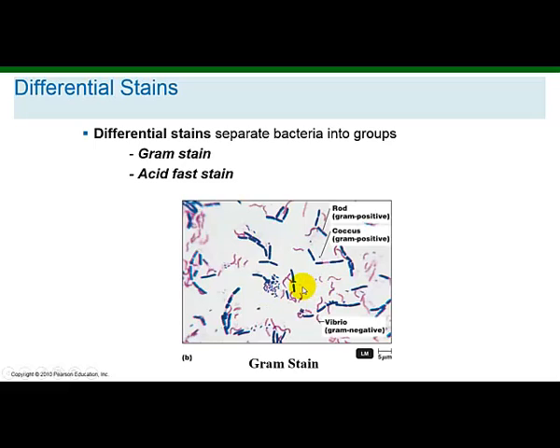You can see a mixture of cell shapes. You'll see some rods, you'll see some cocci, these round ones, and vibrios or spirals. Also, they're just called curved cells. You also notice the two different colors, reddish pink, which are going to be the indication for gram-negative cell types, like this vibrio here, and these purple-blue ones, which will indicate a gram-positive cell type, like these cocci and rods.